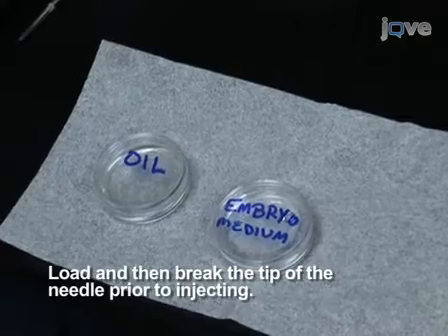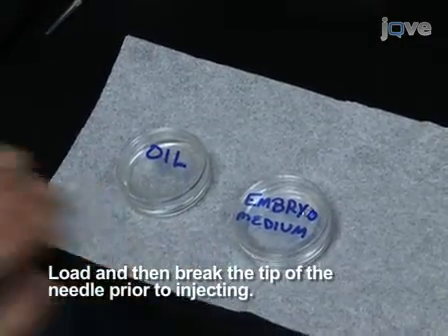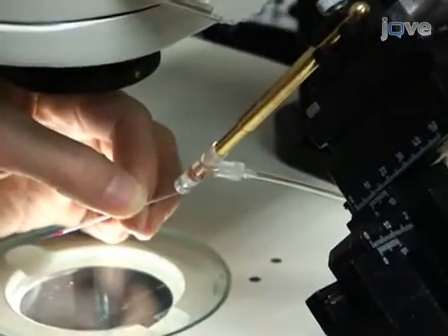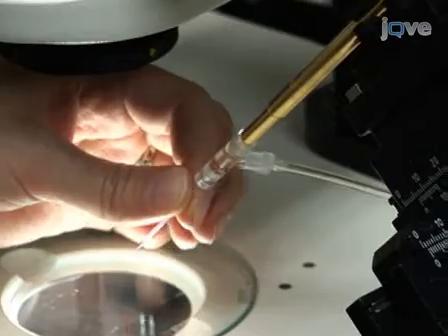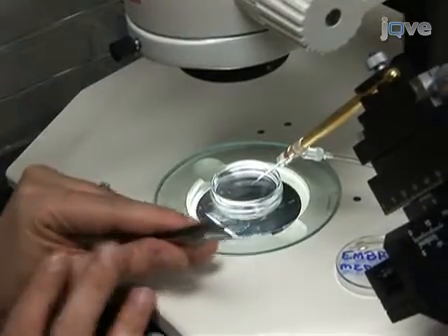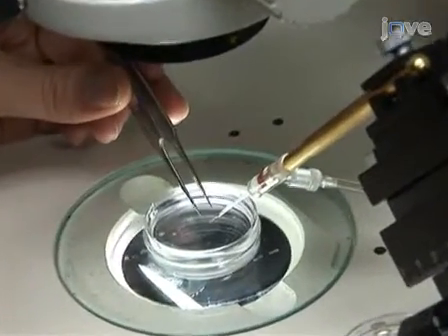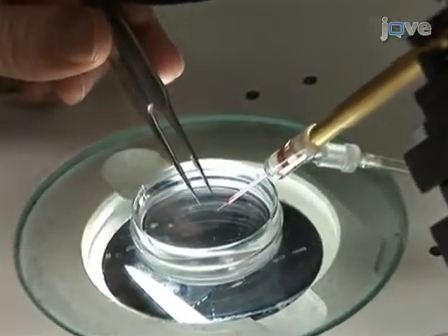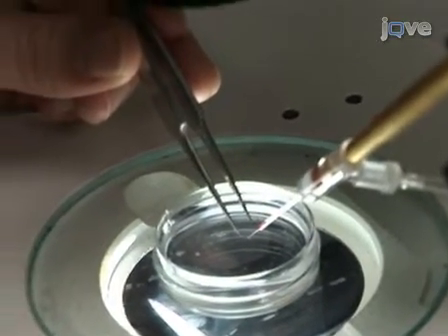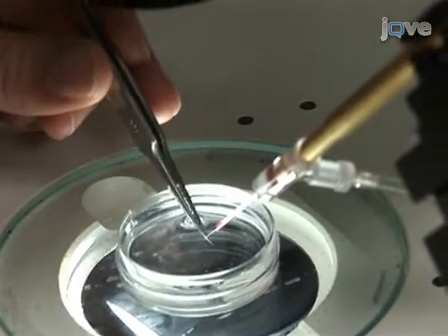We're going to use a dish full of embryo medium to break the needle and a dish full of oil to calibrate the needle. This is just a regular standard lab grade mineral oil. We take a pair of sharpened watchmaker's forceps, and while looking through the eyepieces to determine what the right size would be, we put the forceps on either side of the needle, and then we gently break the tip off, which I can't actually do without looking.